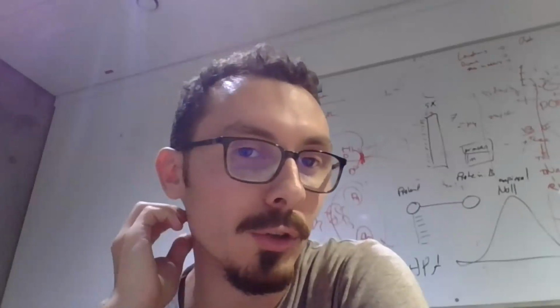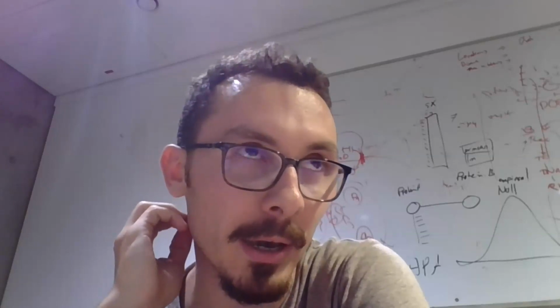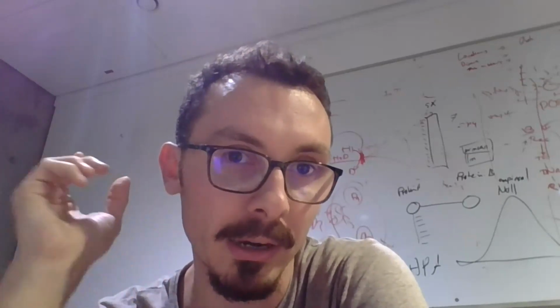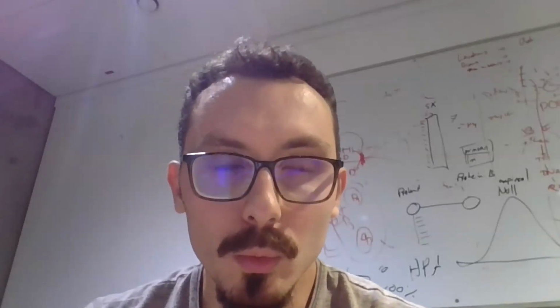Exactly. So you can take care of the batch either at the, I mean, you could correct your gene expression levels, but I actually prefer to include the batch at the differential testing level. These frameworks allow for regressing out these batch effects whenever we are testing for differentially expressed genes. Because I have a feeling, although I don't have proof, that batch effect correction sometimes overcorrects and makes some cells look so similar that should be biologically slightly different. When you project them on PCA plots, they look so similar, because this kind of signal has been removed by batch effect correction.